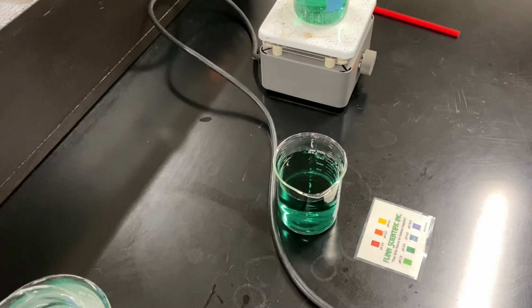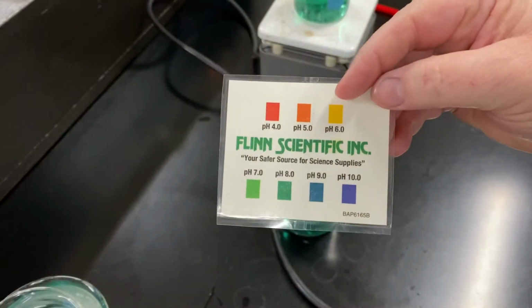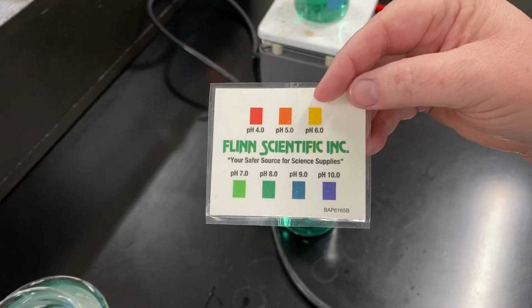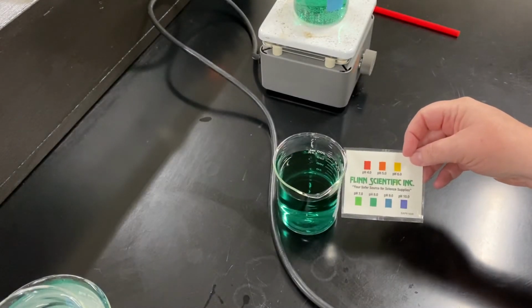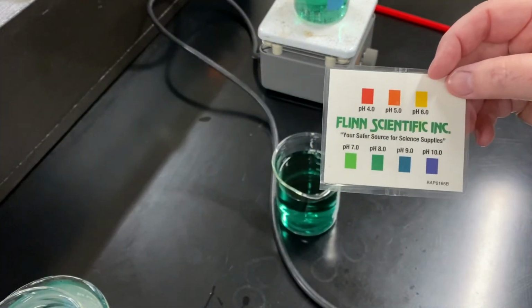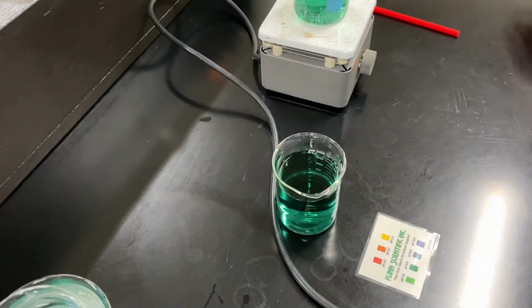The water has been treated with universal indicator. The universal indicator tells us the pH of the water based on the color of the indicator. So right now, as you can see, it's a pretty dark green. I would put it closest to here. So right now our starting pH is an 8. So we're starting with this dark kind of turquoisey green, and that's a pH of 8. So you'll want to write that down.